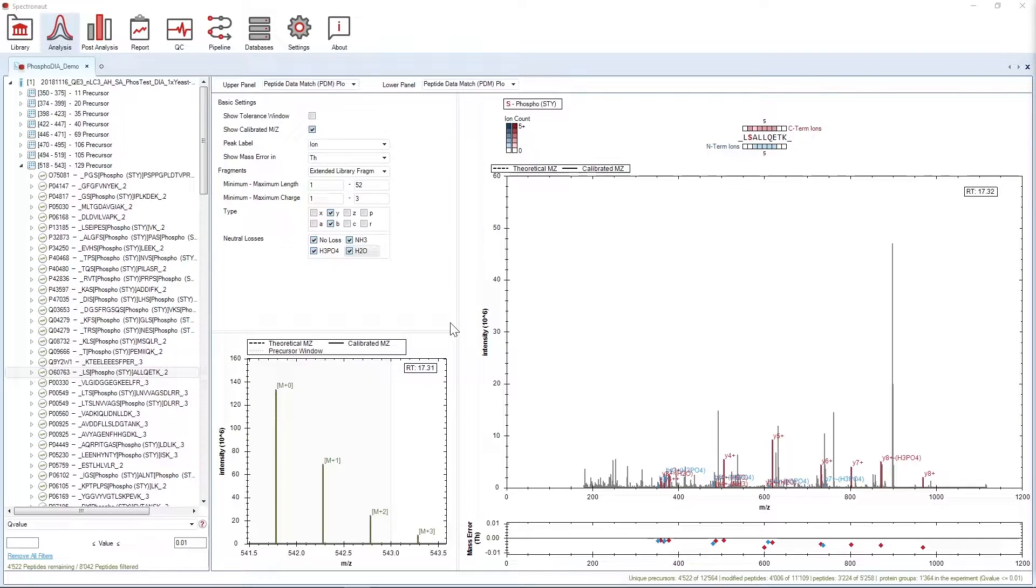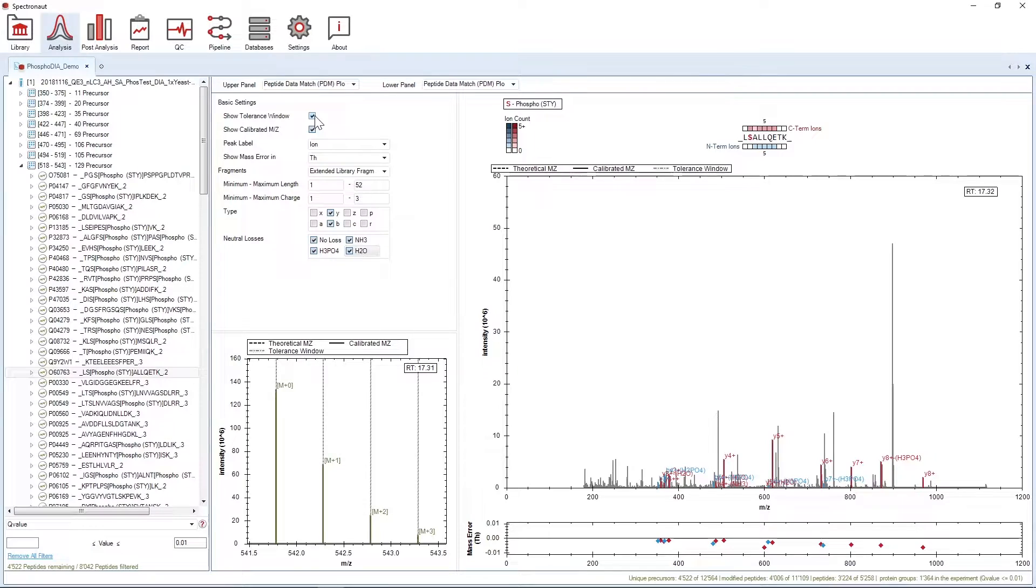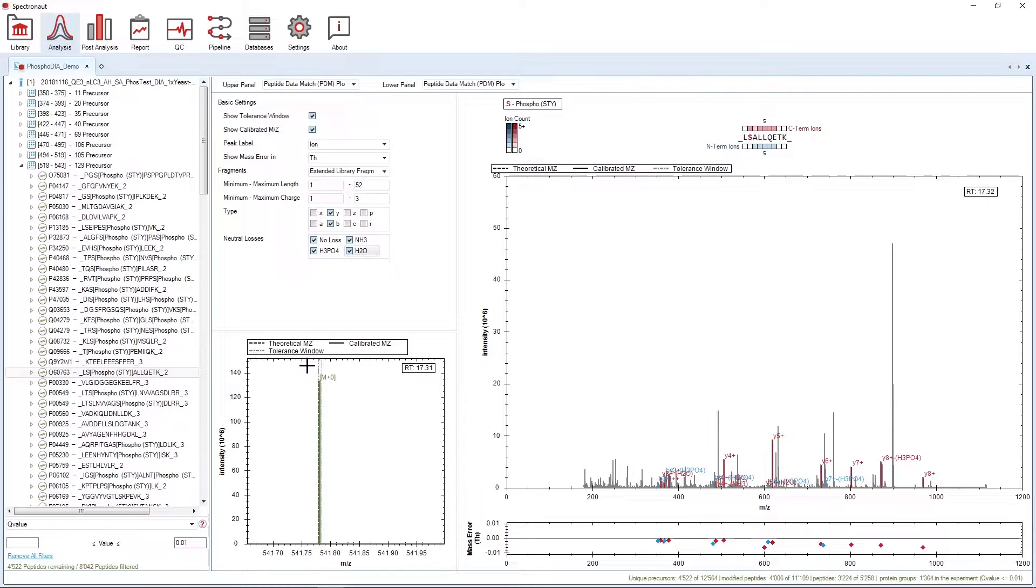Now, let's focus on the settings panel and see how to tune the visualization to your preference. The option Show Tolerance Window allows you to visualize the mass tolerance used for a particular fragment. This applies to both the MS1 and the MS2 scans.